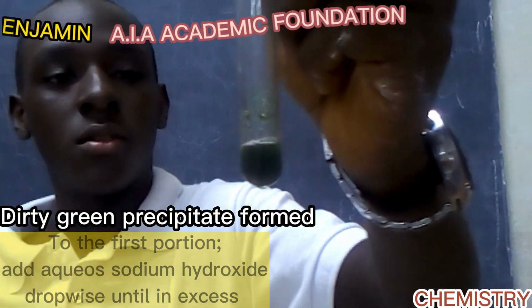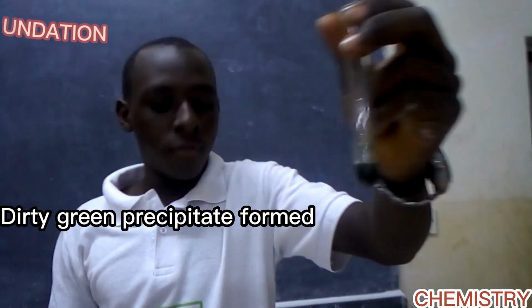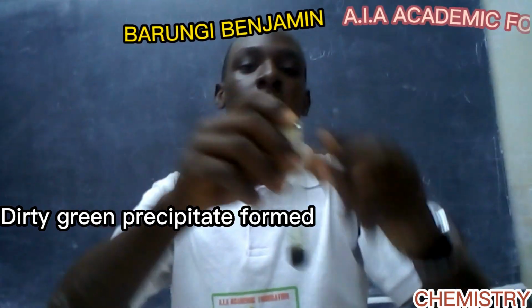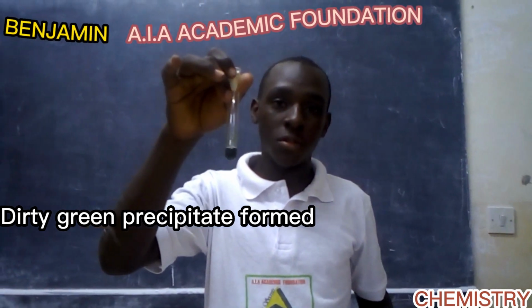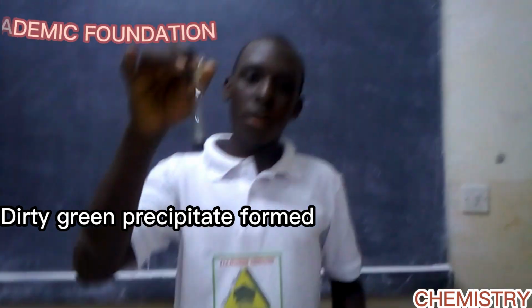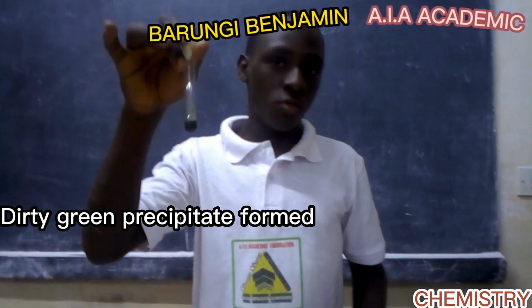So as you write in your deductions, after obtaining results of the zinc granule, you say the yellow solution turned to green solution in your observation, and in your deduction you say iron 3 ions were reduced to iron 2 ions.